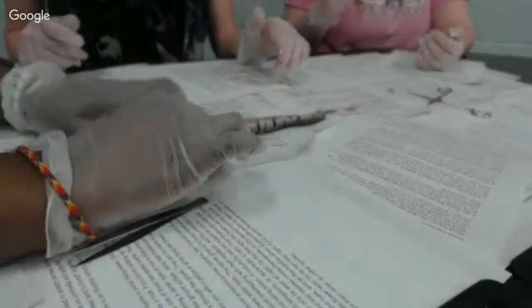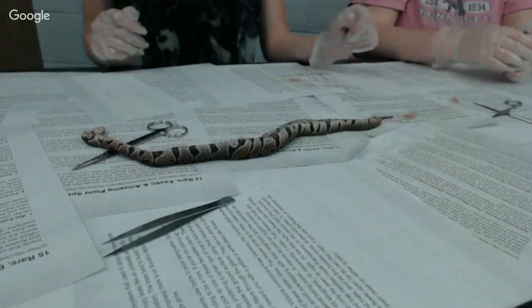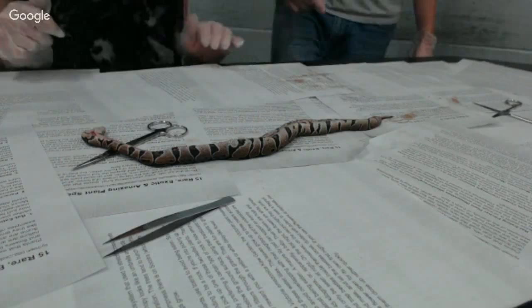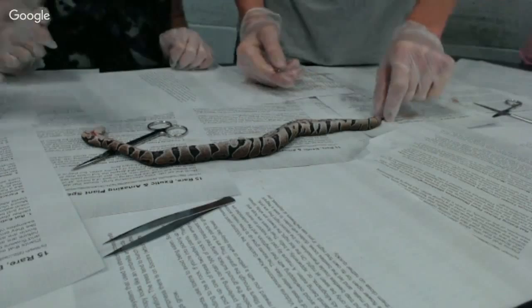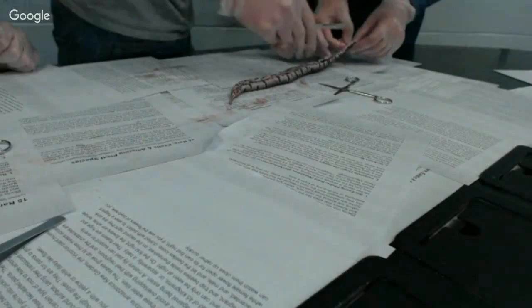Hey, can one of you guys come help these ladies learn how to skin a snake? Yeah. Oh, yeah. It's not on face, it's just audio. Audio and the snake. No, come here, hey, demonstrate and let them do it. How are you supposed to demonstrate? Yeah, I demonstrate. Just do it. You just kind of take it and then just right here. We did it. Yeah, you can see y'all doing it.